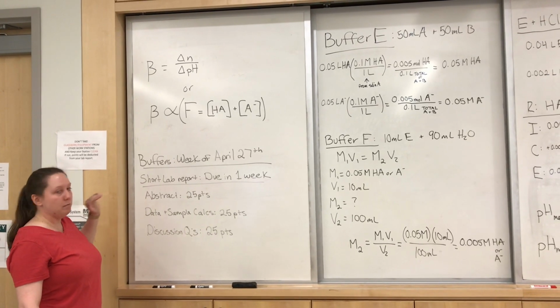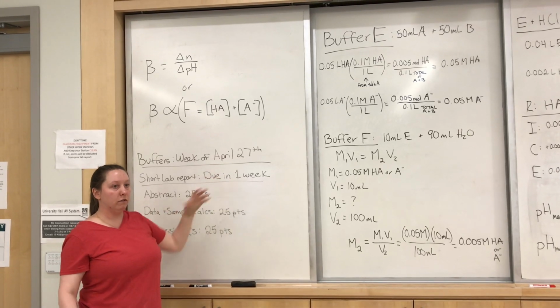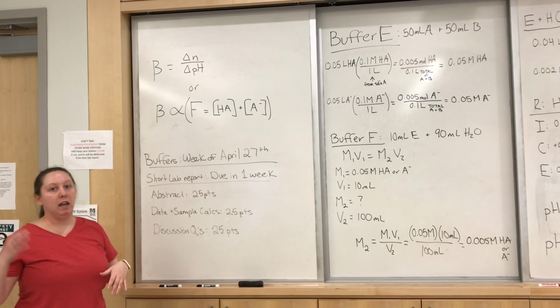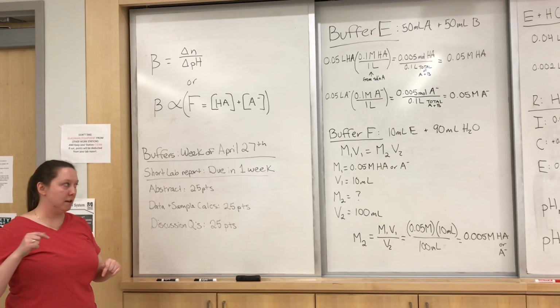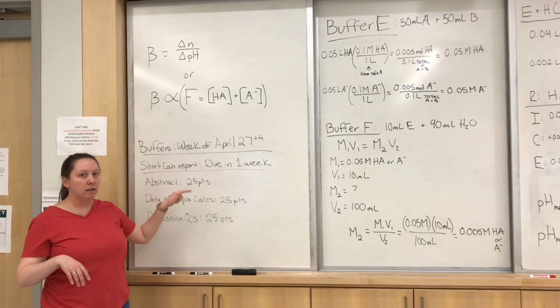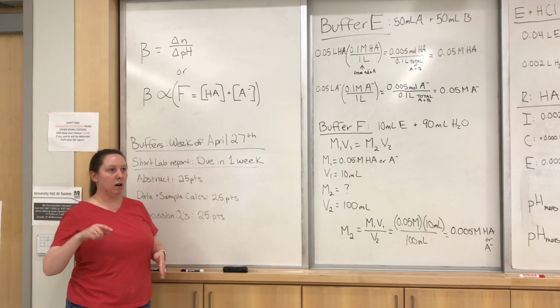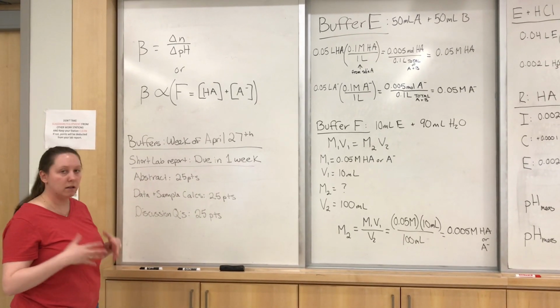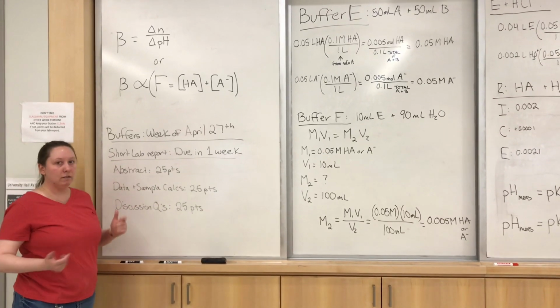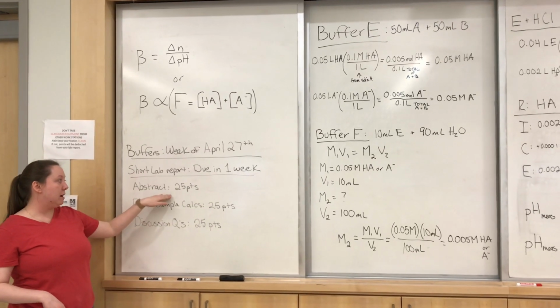Okay, so before we start doing the walkthrough of the experiment, I want to mention the lab report. This experiment is being done the week of April 27th. So for my classes, that's Monday at 1 p.m. and Tuesday at 12:30 p.m. Your short lab report is due in 1 week. So what that means is the midnight before your next lab session. Just the same as normal, even during the shutdown.